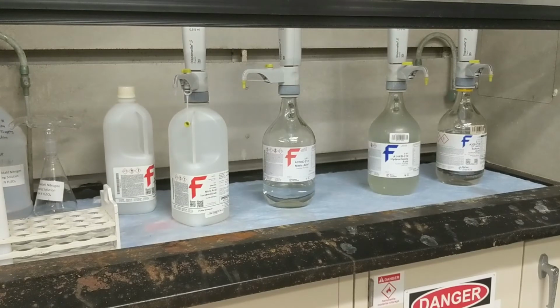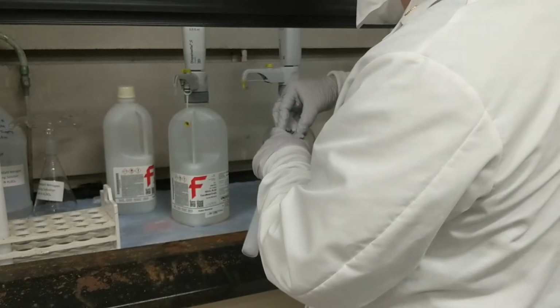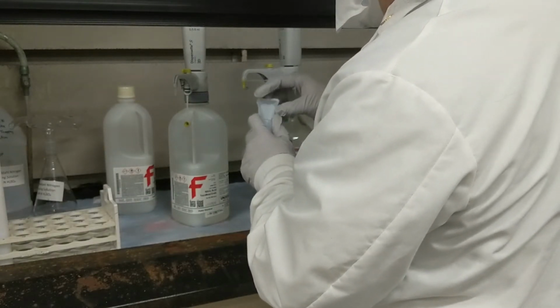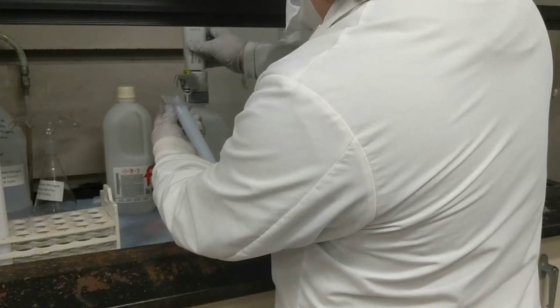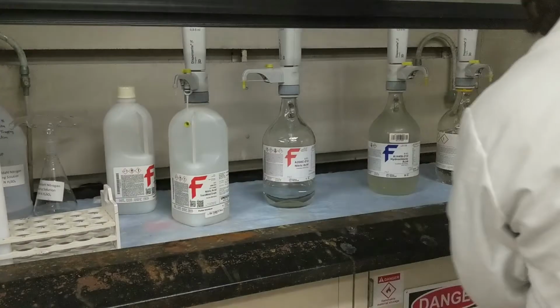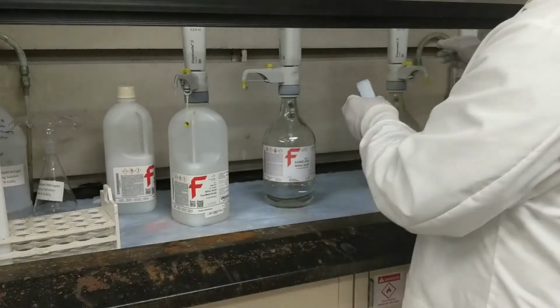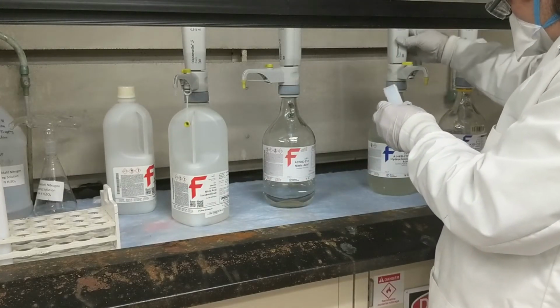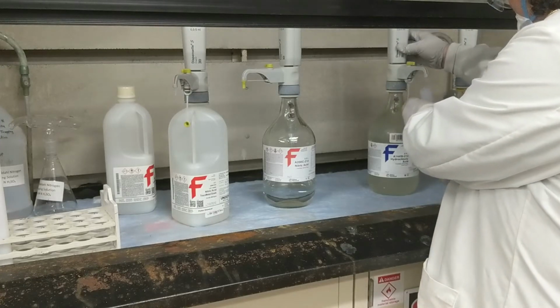We have a harsher digest that we use generally only for the OES and only when we are looking for specific elements. The ones that come to mind are calcium and iron, but basically anytime you run a sample and you find your QC is low, it could be because the digest wasn't powerful enough. So this digest is 7.5 milliliters of nitric acid and 2.5 milliliters of hydrochloric. So you can see I did the same thing where I rinsed the boat with 5 milliliters of nitric, but then I added 1 squirt of the nitric and then 1 squirt of the hydrochloric.